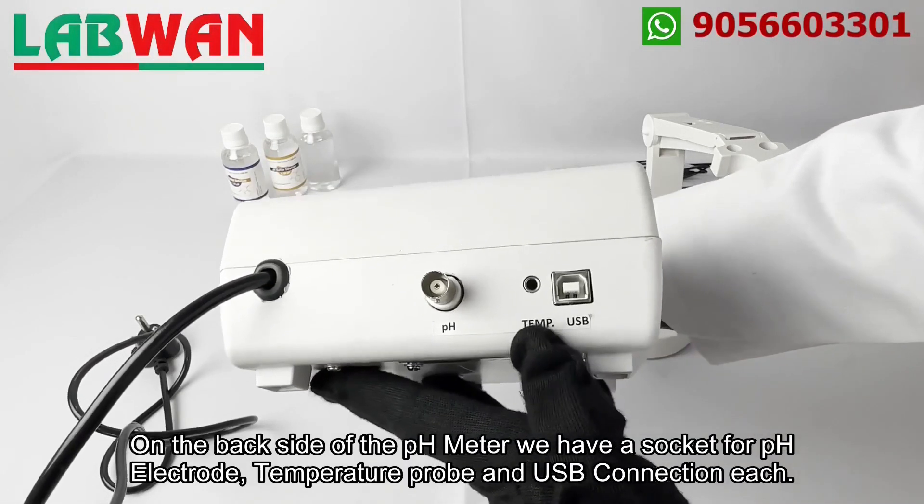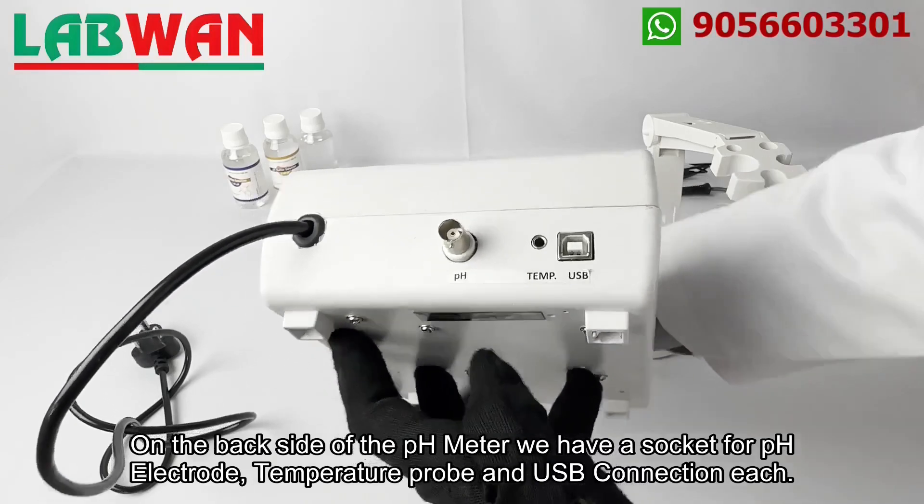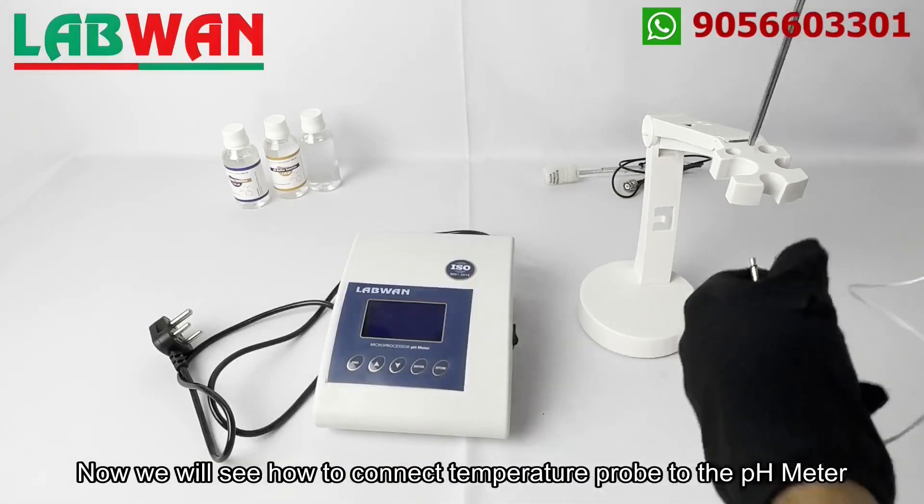On the back side of the pH meter we have a socket for the pH electrode, temperature probe, and USB connection each.